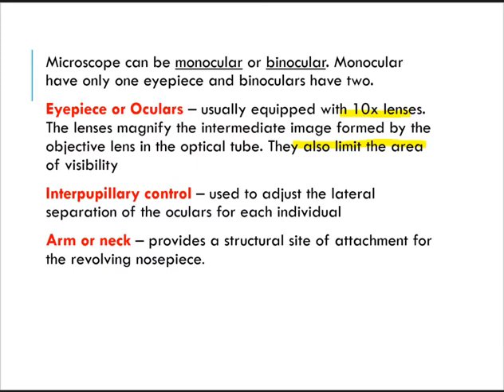Anyway, we also have the next part of the microscope, your interpupillary control. It is used to adjust the lateral separation of your oculars for each individual.